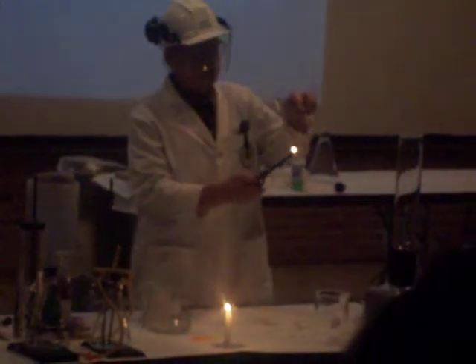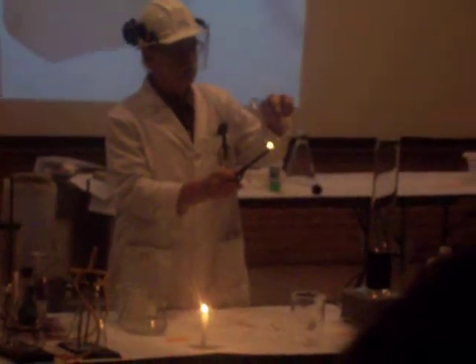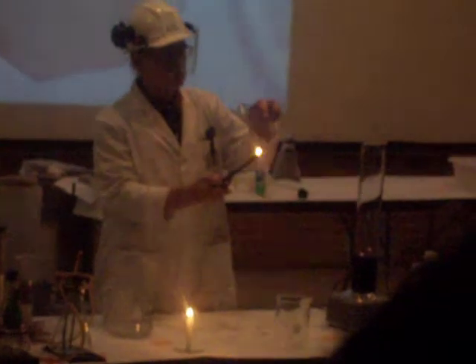Well, let's look at another reaction here. I have in my hand some magnesium ribbon. It turns out that magnesium is more chemically reactive than carbon, and once I get this ignited and put it down in the beaker of carbon dioxide, the magnesium actually pulls the oxygen away from the carbon, and it keeps burning down inside. Well, we've got a little bit left here.